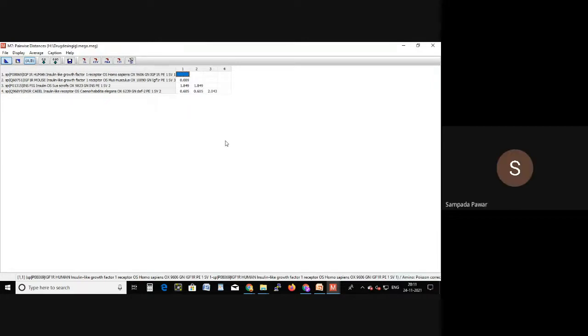Sir, why do we always save mega dot fasta files in inverted commas? Inverted commas mean a string. We are asking the string operator to save that particular position only. We are not asking the outside file to save in that string.